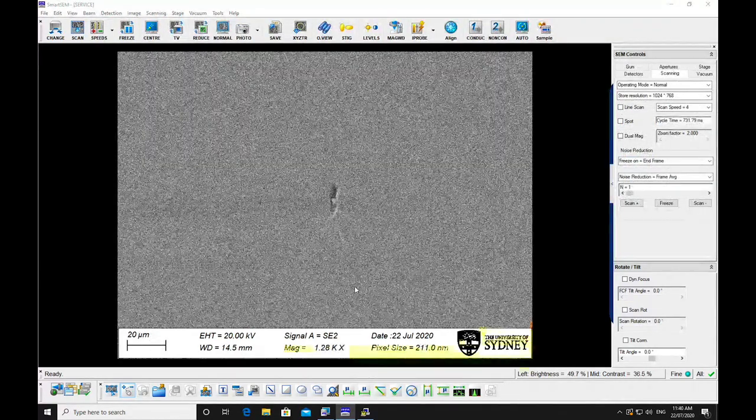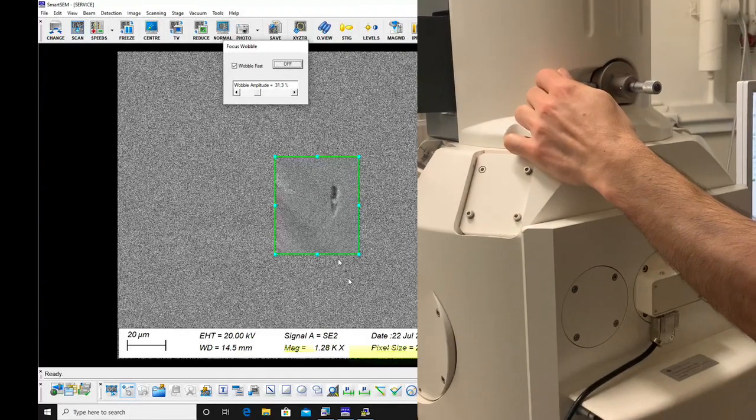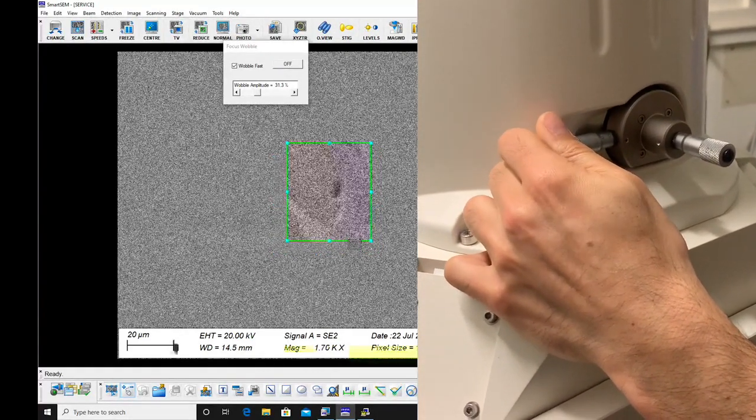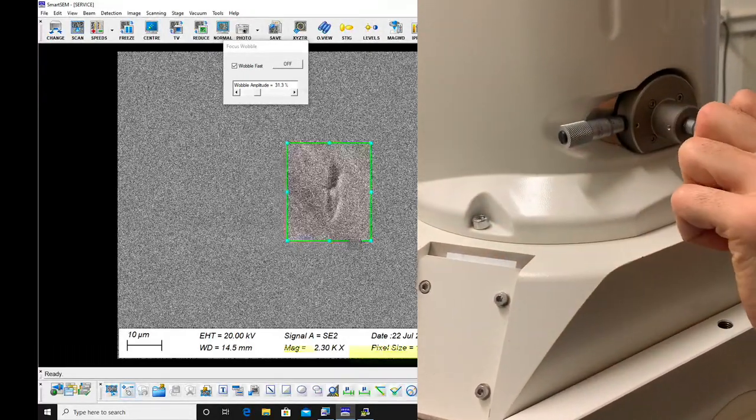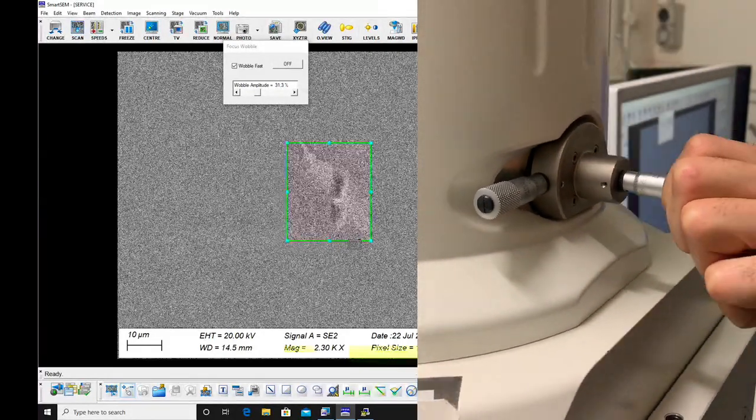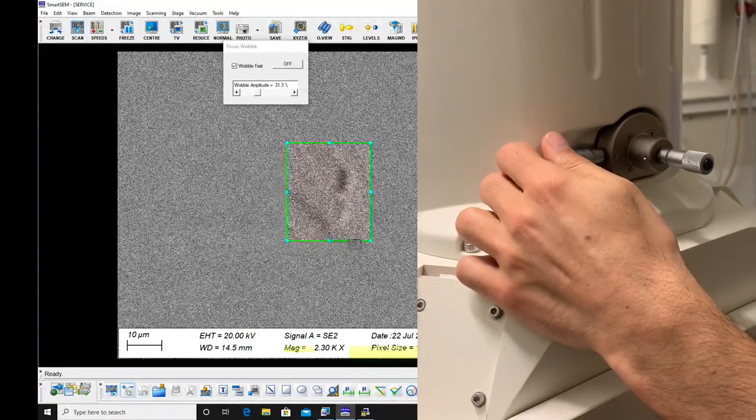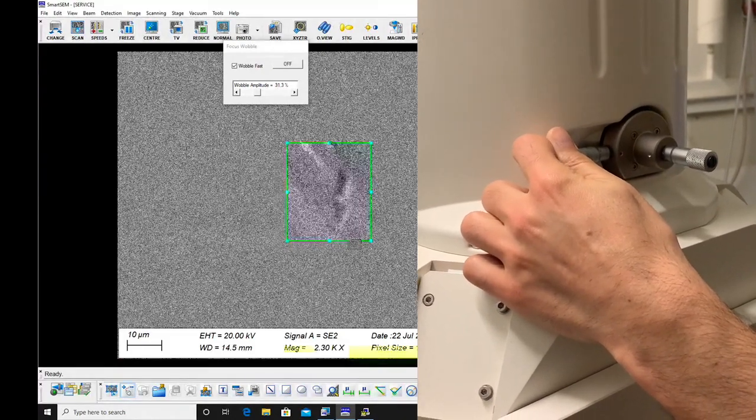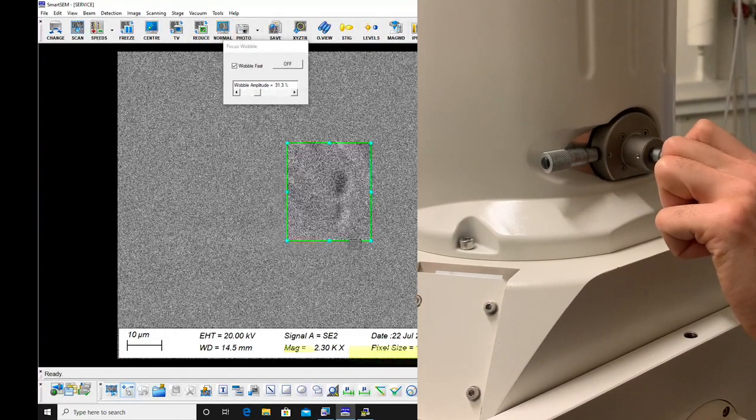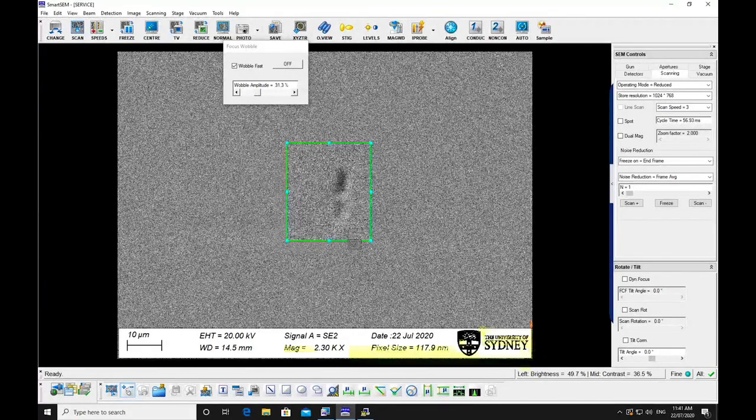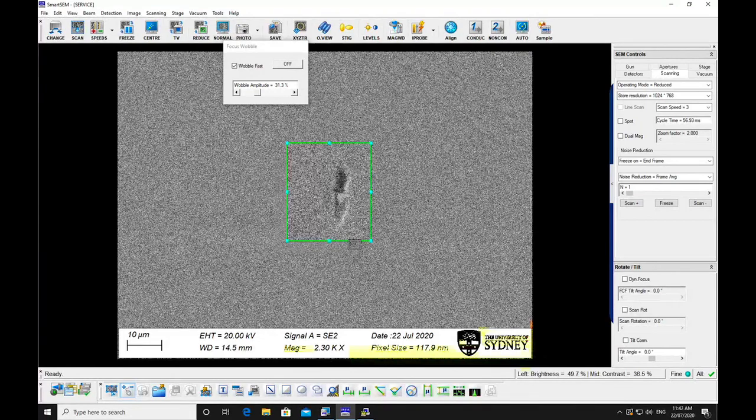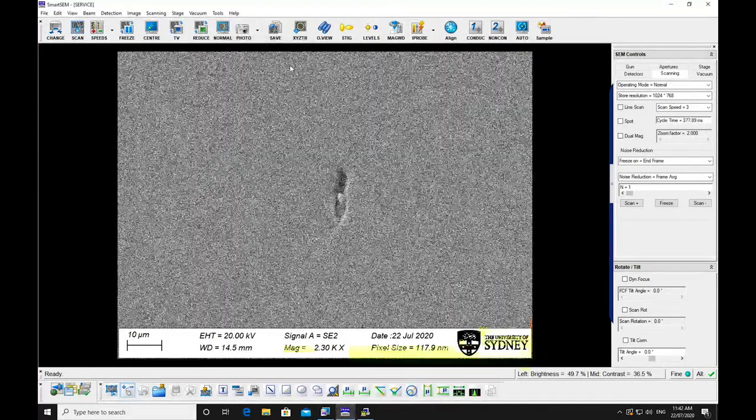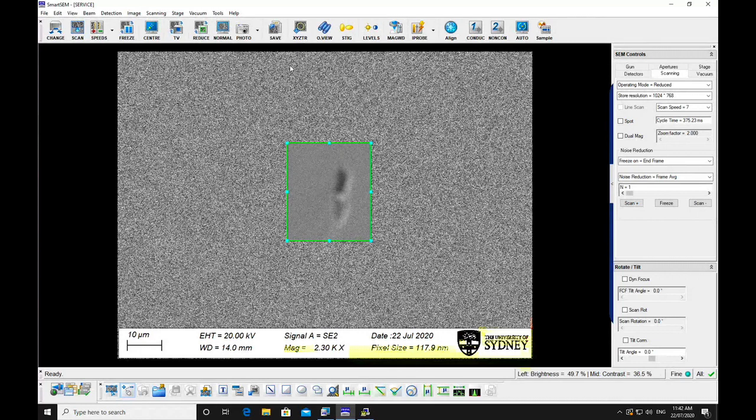Focus and stigmate the image at a high magnification and press the wobble button. Centre the aperture manually by using the X and Y micrometers located on the microscope column. Minimize the movement as the focus wobbles. Turn off the wobbler. The aperture should be realigned after significant changes to beam energy or the opti-beam mode.